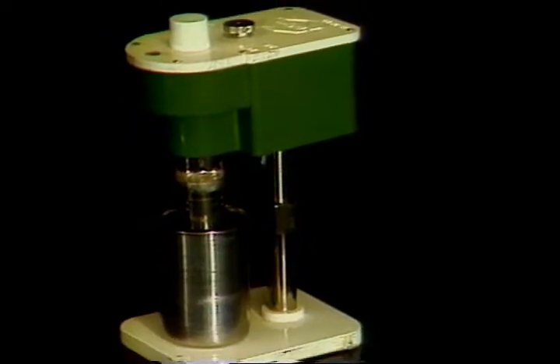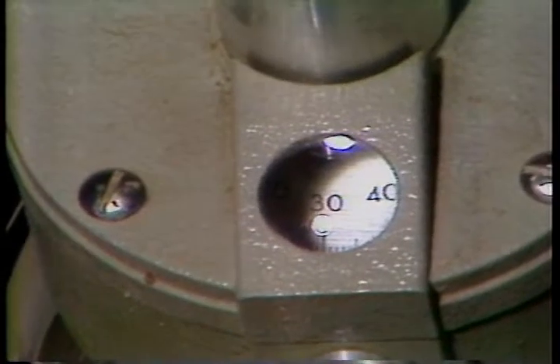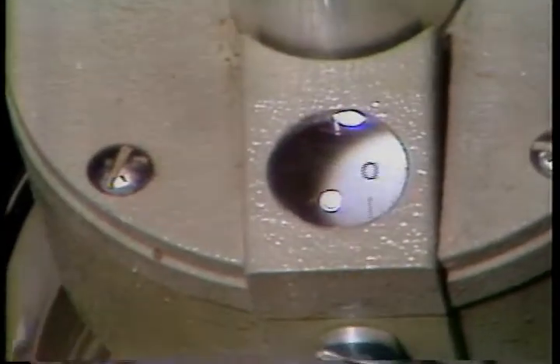Here's how it works. There's a solid cylinder that's attached to a needle or scale. A spring brings it to a zero position.